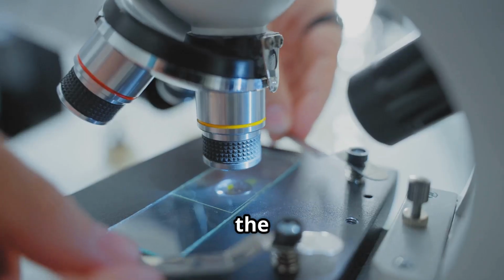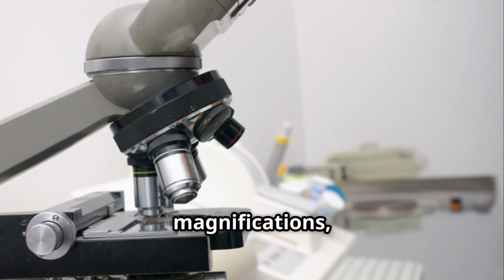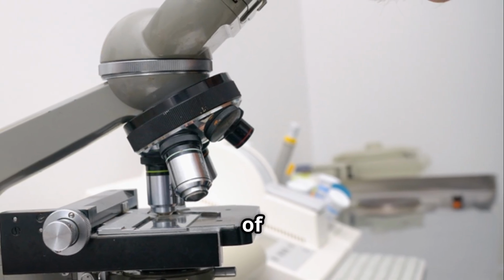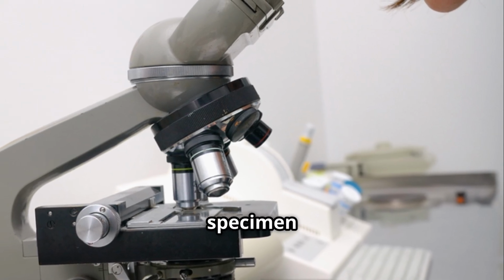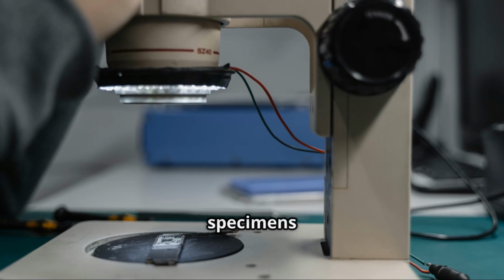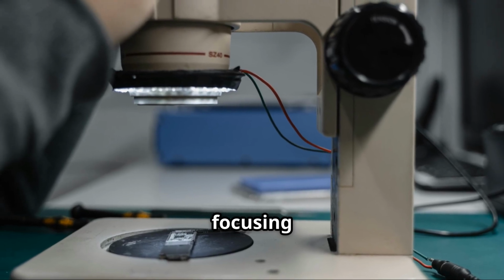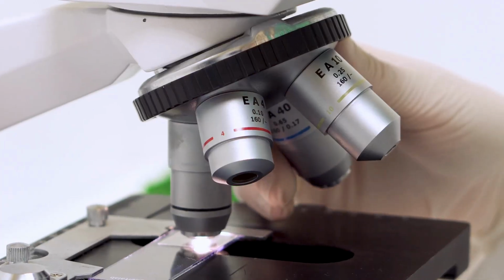Depth of field is the thickness of the specimen that is in focus. At higher magnifications, the depth of field is smaller, meaning only a thin slice of the specimen is in focus at a time. This is why thicker specimens may require focusing at multiple layers to obtain a complete image.